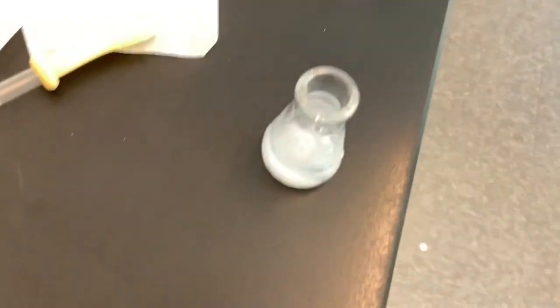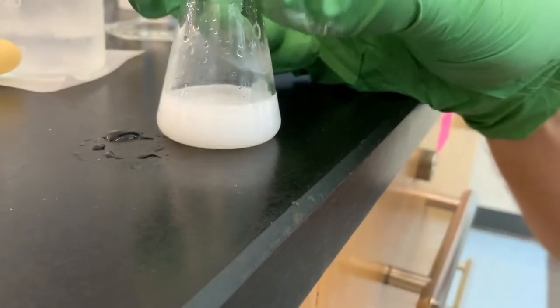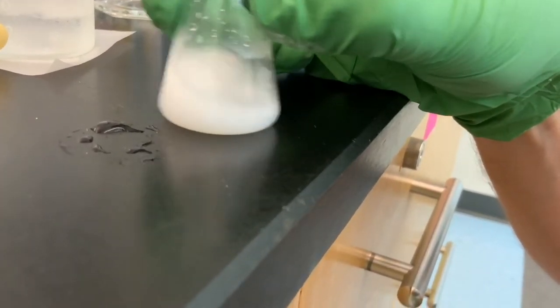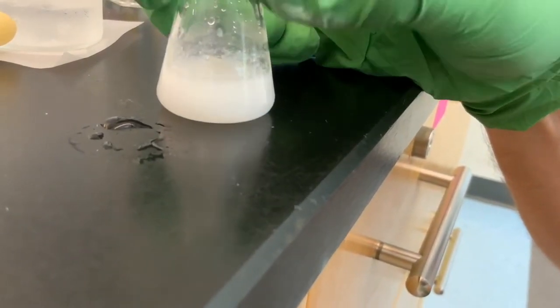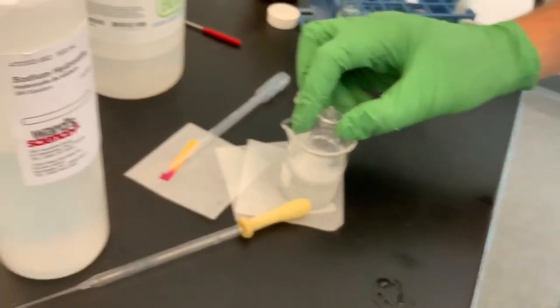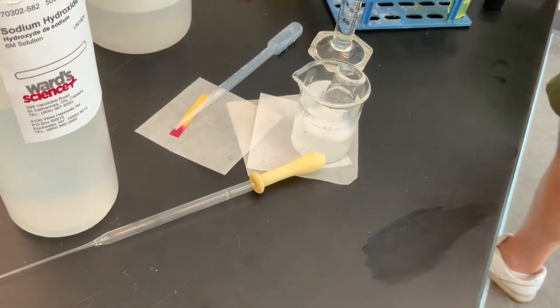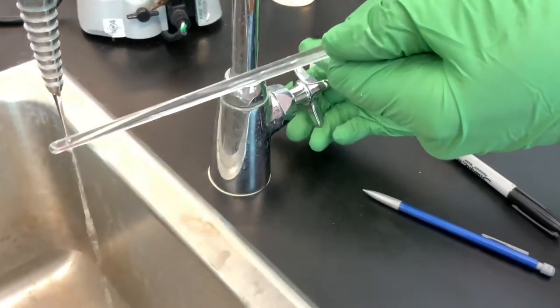And this solid is the free base. I'll wipe off the water so we can get a better visual. This white solid now, if I swirl it around, you see that is now benzocaine, right? This is now neutral benzocaine. We've neutralized the solution with 6 molar sodium hydroxide. So now we're going to test the pH. It should be near neutral, or perhaps we added so much that it's now basic, but it's good that we're seeing solid, because that's how we're going to isolate the benzocaine via vacuum filtration. So I'm still going to keep it in the ice water bath, because of course that'll decrease the solubility and will maximize our percent isolation. And so I'm going to use the same stir rod, but I'm going to rinse it real quick because it has some residual HCl on it, of course.